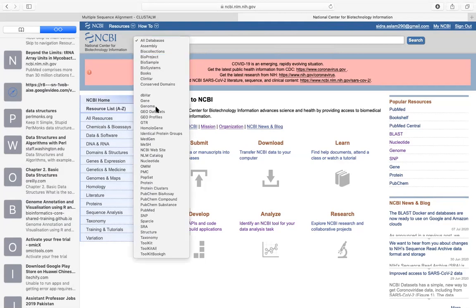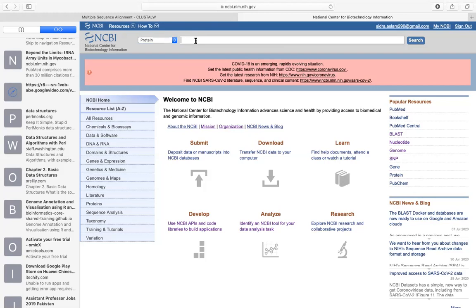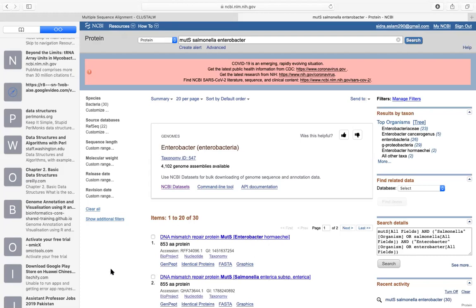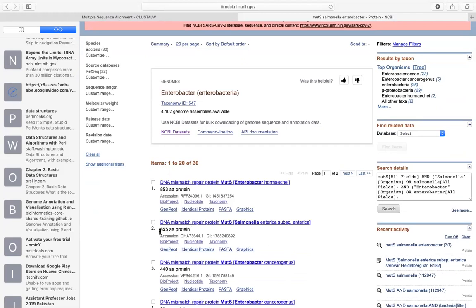I was thinking about a gene — the MUTS gene, M-U-T-S. This is a protein-coding gene. I wanted to search it in Salmonella. It's showing this is a DNA mismatch repair protein MUTS. The first result is from Citrobacter, but I want it in Salmonella enterica. The second one is mine — Salmonella enterica MUTS, with 855 amino acids in length.